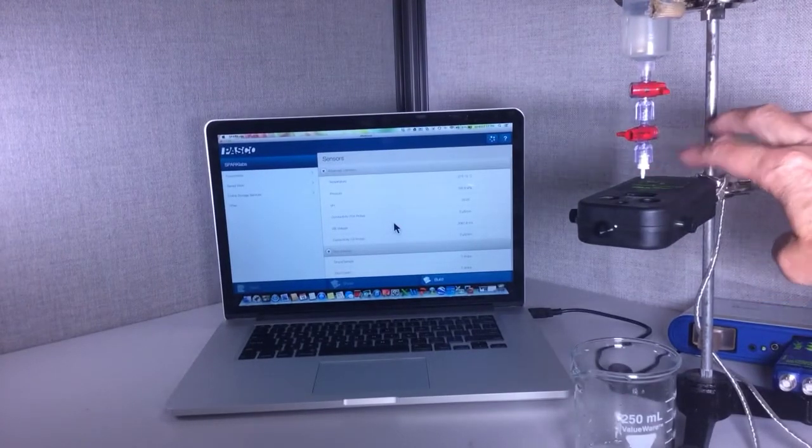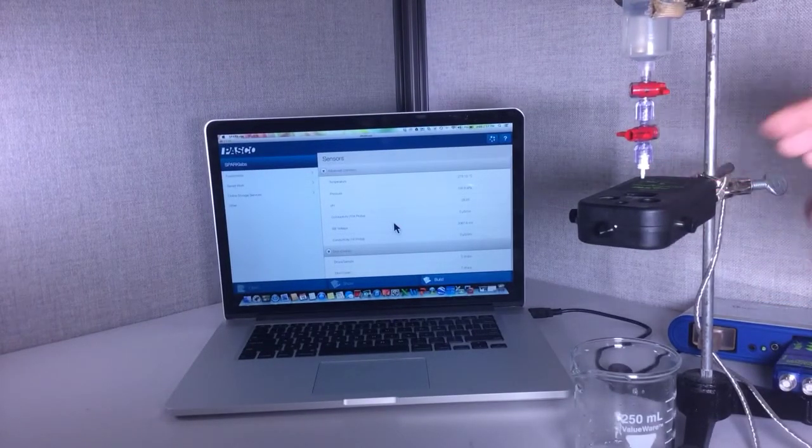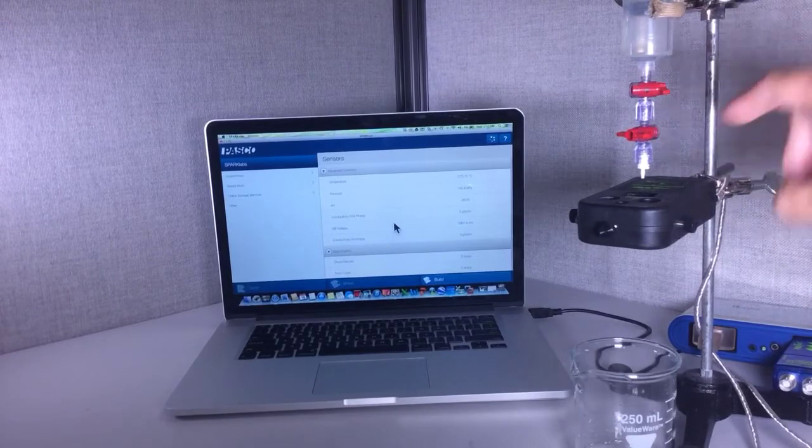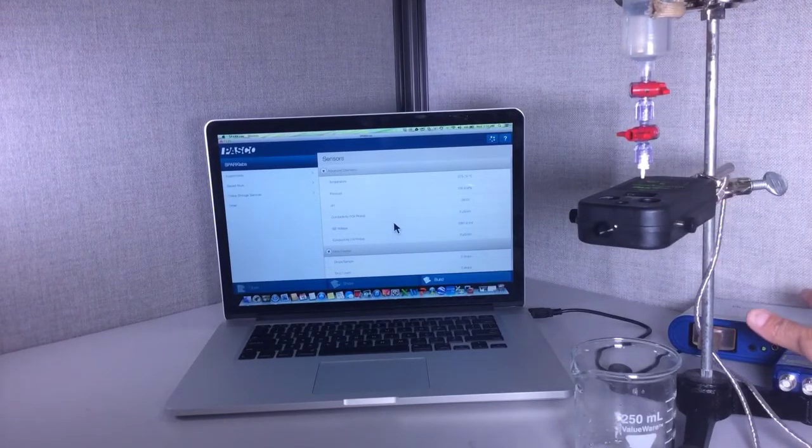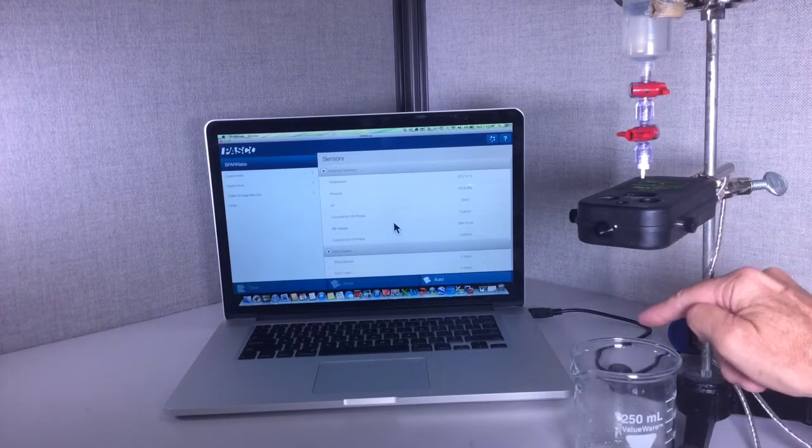How do I calibrate a Pasco Scientific drop counter? To do this, I first have to connect the drop counter to an interface, then the interface to a computer.